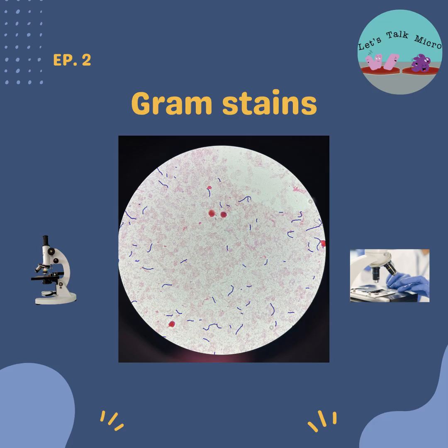And before we actually get to the procedure, let me just circle back. We talked about how you make your smears. Depending on the source, you have two types of smears. I just want to make sure I mention that. You have your direct smear and you have your indirect smear. What I was talking about, when you put your sample on the slide and you roll the swab, that's called a direct smear. This is you preparing your smear from the primary clinical sample that you receive in the lab.